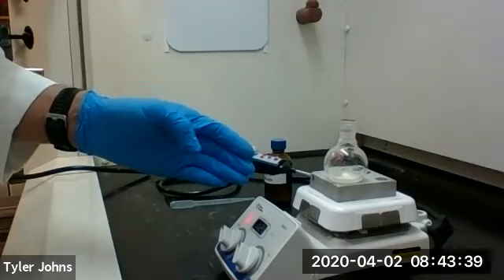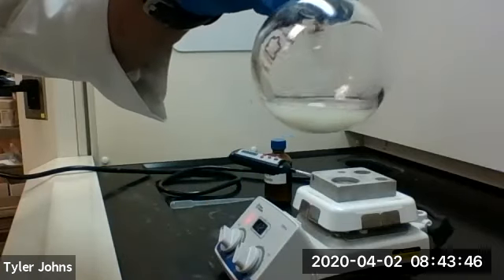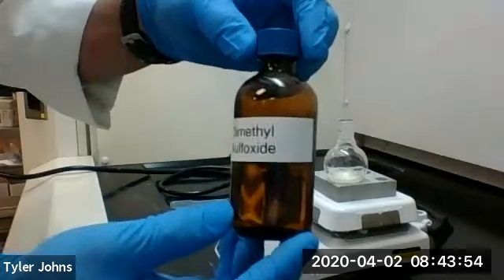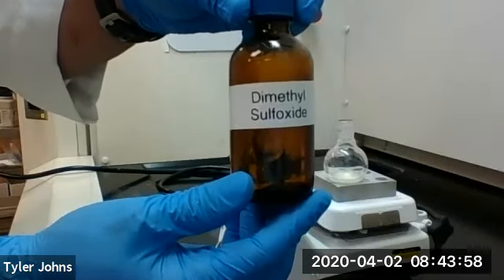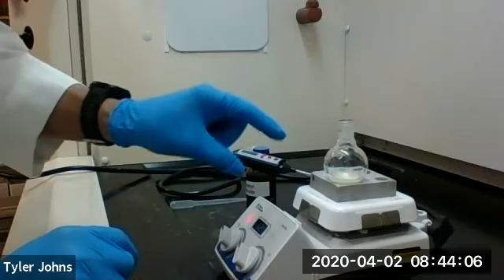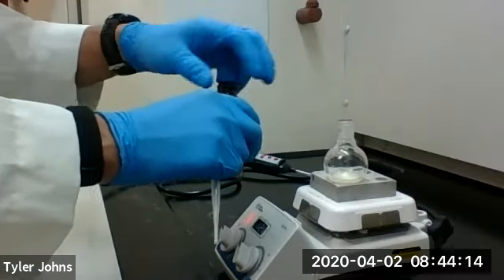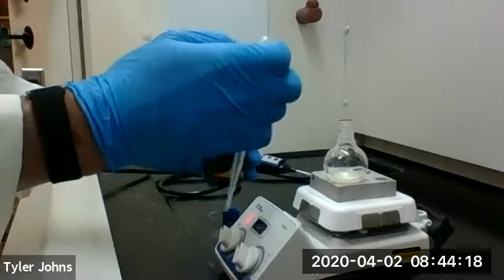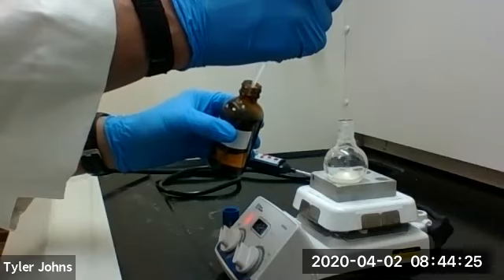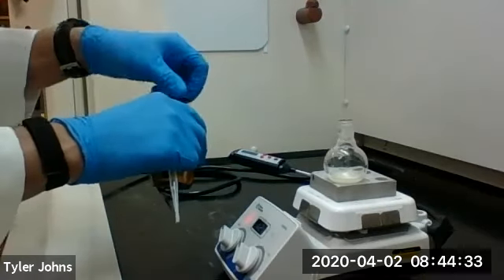So we've had our chalcone stirring in the methanol with gentle heating for a little while, and it's having some difficulty going into solution. So we're going to help it go into solution by adding dimethyl sulfoxide, or DMSO for short. We're going to add this a half milliliter at a time with continued stirring and heating until the chalcone goes into solution. DMSO helps improve the solubility of highly polar chalcones.